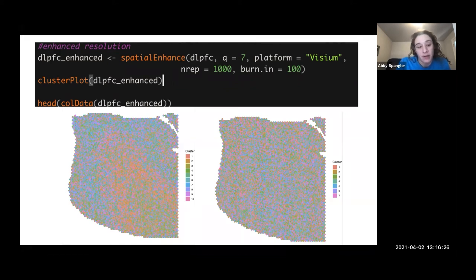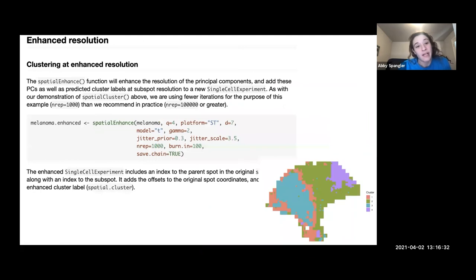So I probably have to look into some different parameters of this process, but for their data it looks a lot better. You basically get an enhanced resolution image of the clusters.